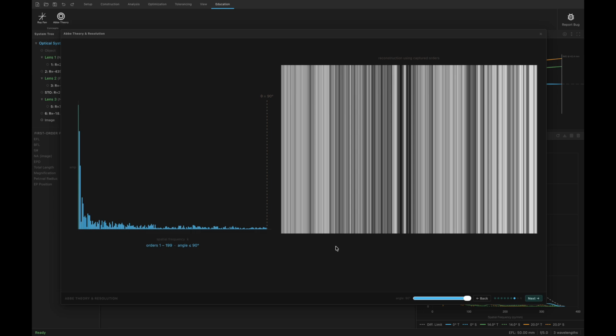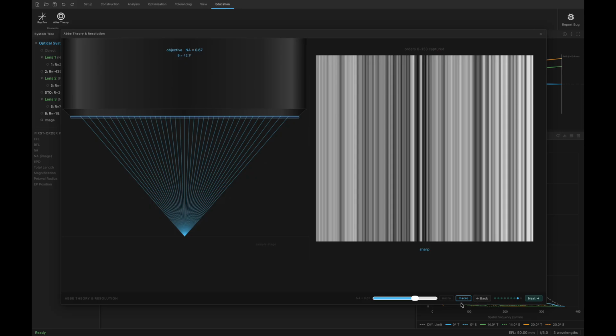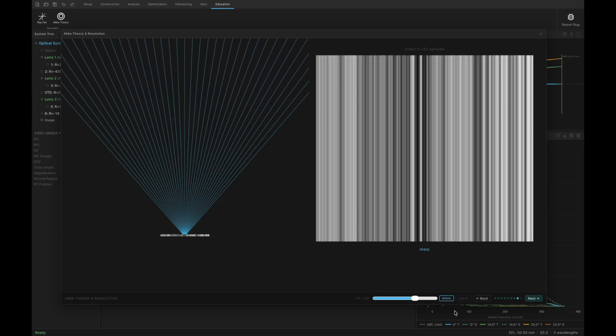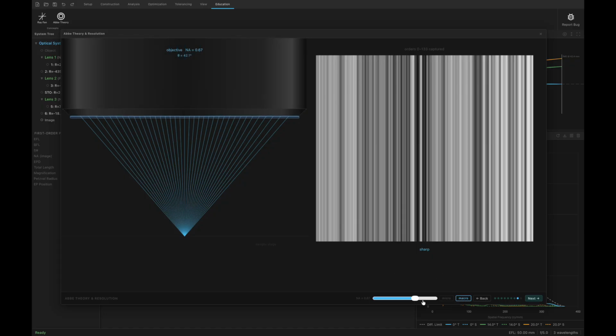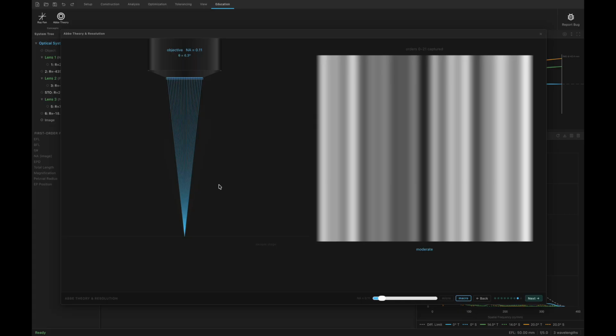So let's look at the same kind of concept, but back in a microscope form. So down here, you have your sample, and up here, you have your microscope objective. And again, as we capture a small angle of light, only the diffraction grating components that are emitting light at a low angle, or that are capable of giving their information at a low angle, those are going to be the coarse ones, the low frequency ones.